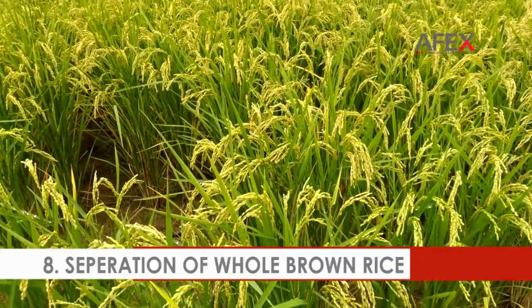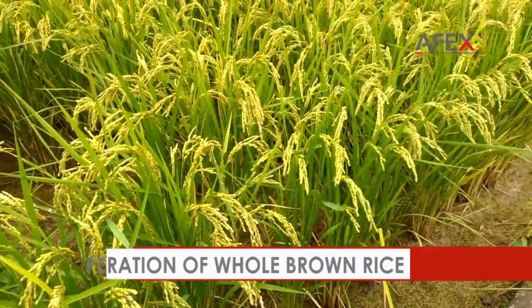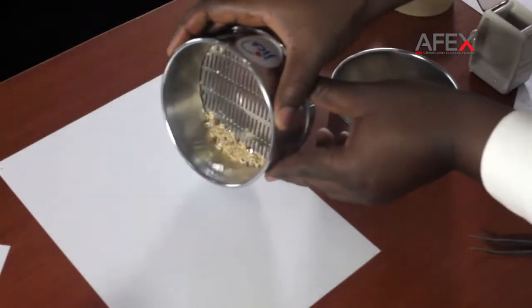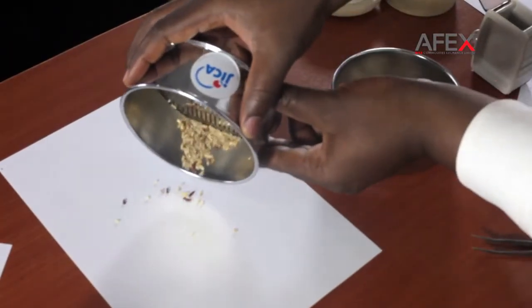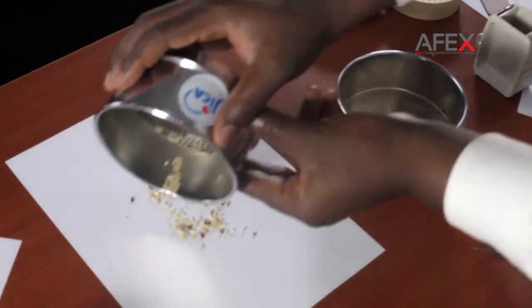Separation of whole brown rice. Brown rice which did not pass through the sieve may also contain broken grains. Manually separate whole brown rice from broken rice.